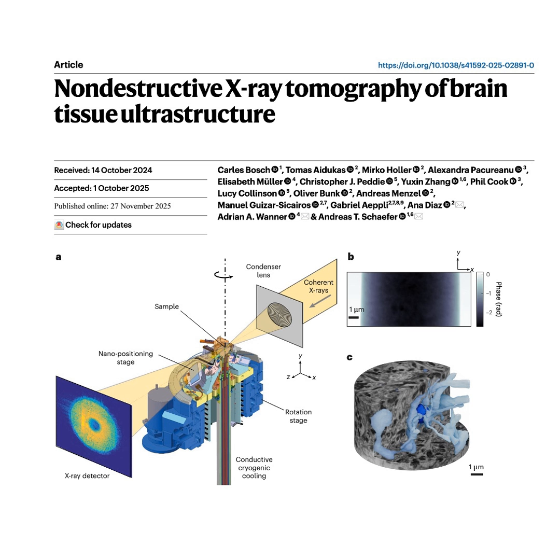To get the kind of high-res image you need to see a synapse, to get that ultrastructural detail, you need incredibly high-energy, intense X-ray beams. And intense X-rays are beams of ionizing radiation. They just blast the biological material. They deform it, they cook it, and ultimately they just disintegrate the tissue. So we're just trading the mechanical damage of slicing for the radiation damage of high-intensity light.